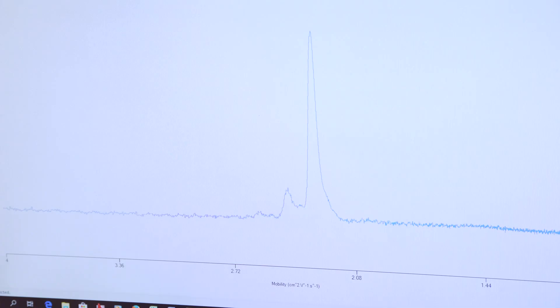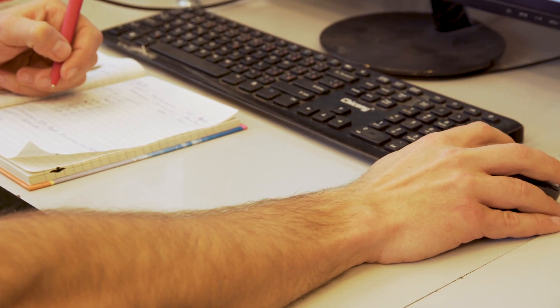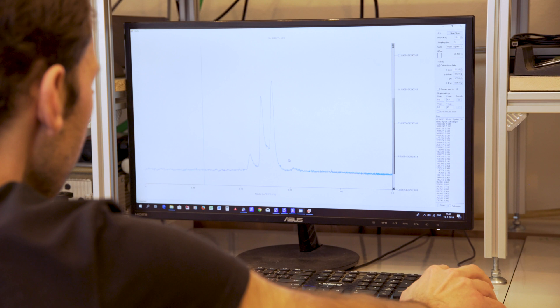These instruments are very useful and very sensitive — we can detect below 1 ppb. They also have a very fast response; we need only 2 or 3 seconds to show the new ions in the spectra.